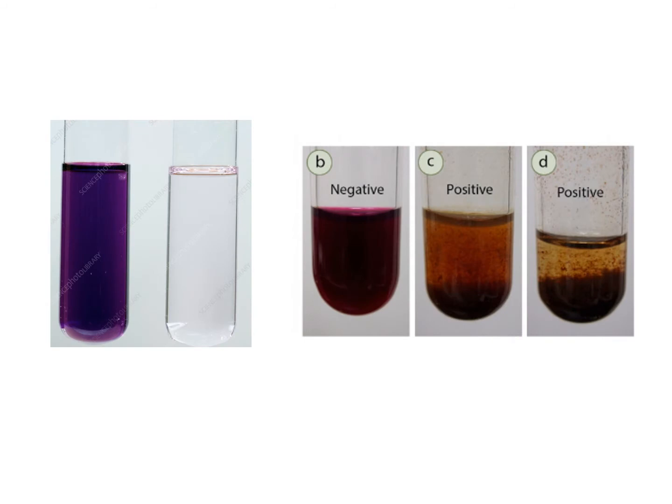In the slide, you are shown the test result when it is acidic, from purple to colorless, and when it is neutral, from purple to a brown product. The precipitate here is the manganese dioxide precipitate, which is brown.